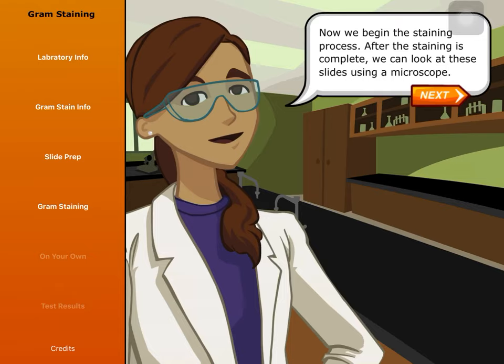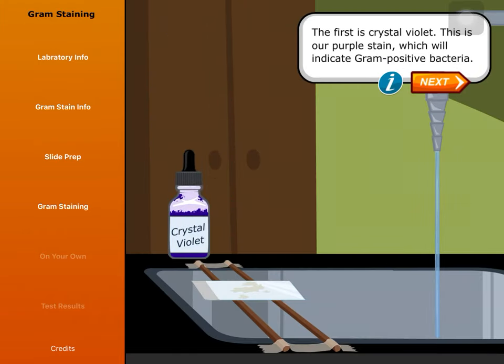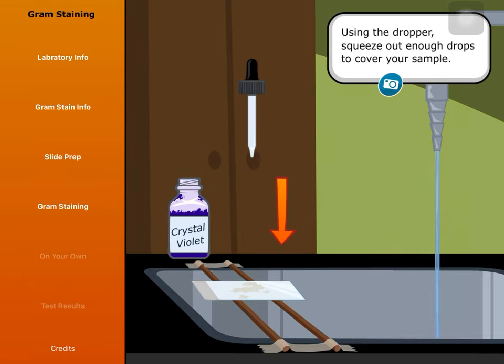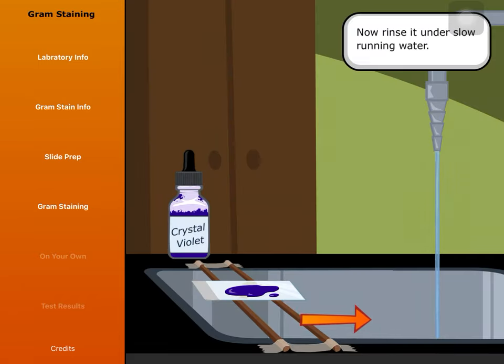Now we begin the staining process. After the staining is complete, we can look at these slides using a microscope. We use four chemicals to stain a slide, applied in a specific order, rinsing the slide off under slow running water between each chemical. The first is crystal violet — our purple stain, which will indicate gram-positive bacteria. Using the dropper, squeeze out enough drops to cover your sample. Let that sit for 60 seconds, then rinse it under slow running water.